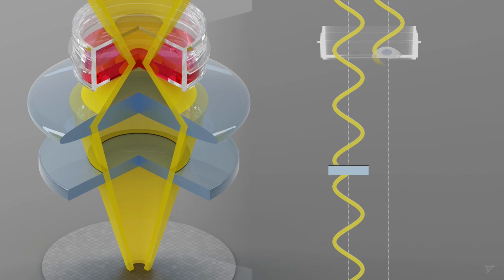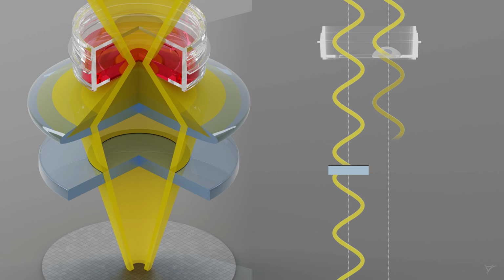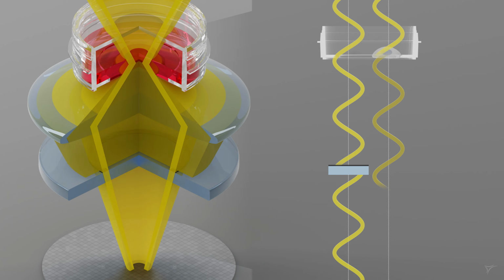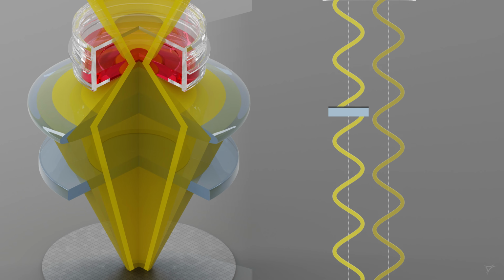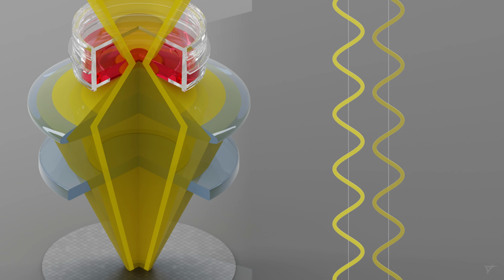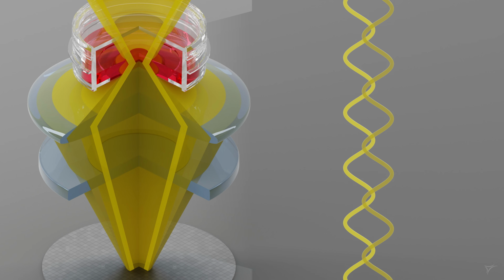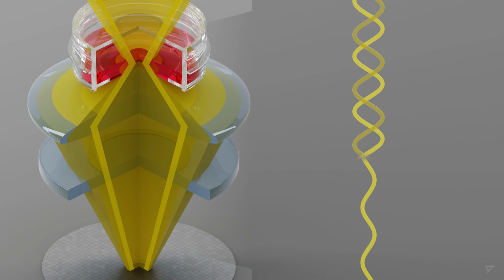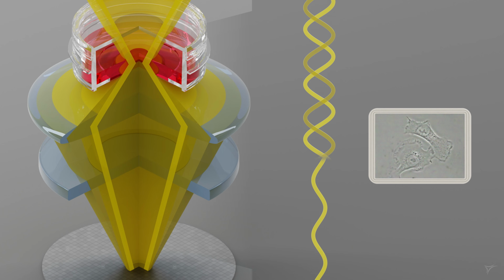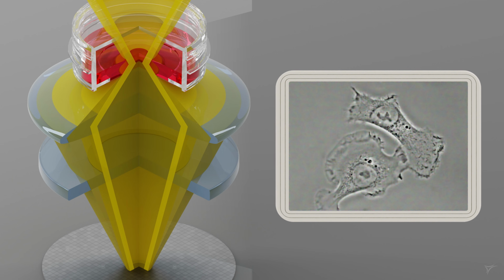However, the light passing through the sample undergoes a slight phase shift and becomes scattered. Due to this scattering, it loses its tube-shaped structure, and thereby most of this light bypasses the phase ring. Now, the light passing through the phase ring with defined phase shift interferes with the light coming from the sample, creating an interference pattern. This interference pattern leads to an altered amplitude and by this, to an increase in contrast, making the non-pigmented cells clearly visible.